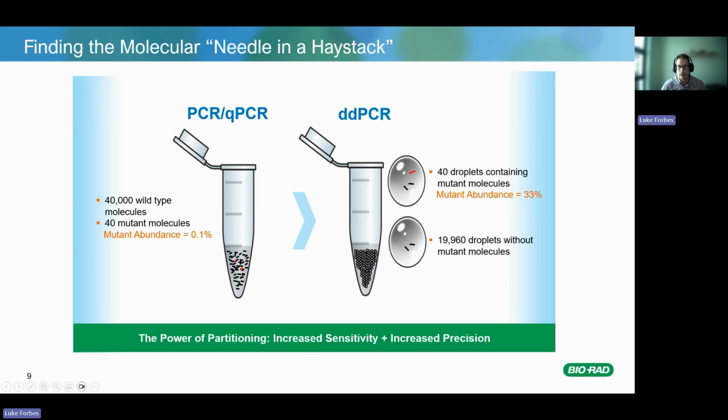Now, I also just want to expand on this a little bit more because obviously we're specifically focusing on real-time PCR versus digital PCR in this instance. So if you think of real-time PCR, think of it as like estimating how many fish are in a lake or in a dam by taking the number of samples over time.